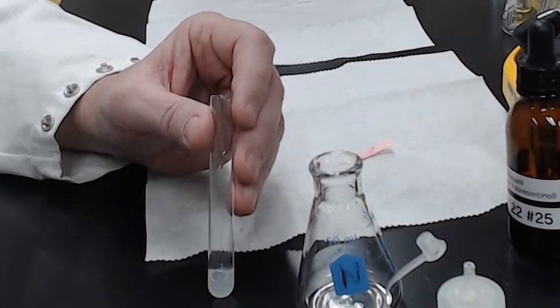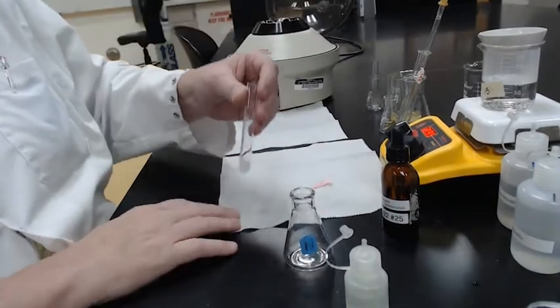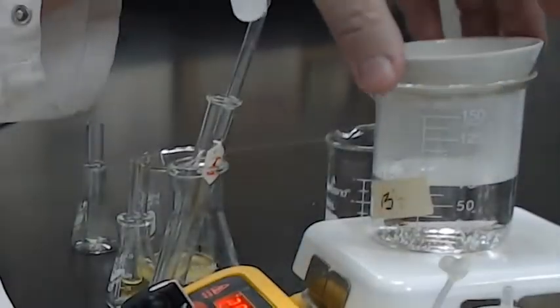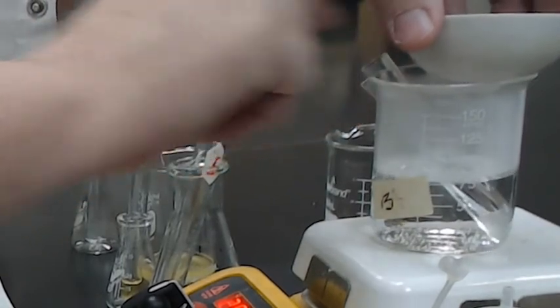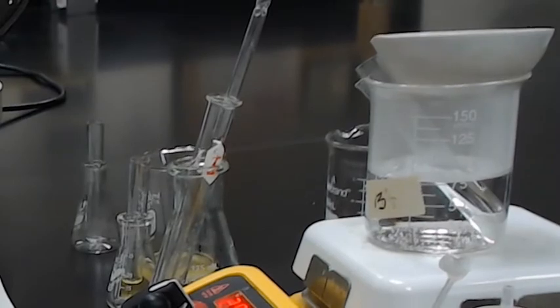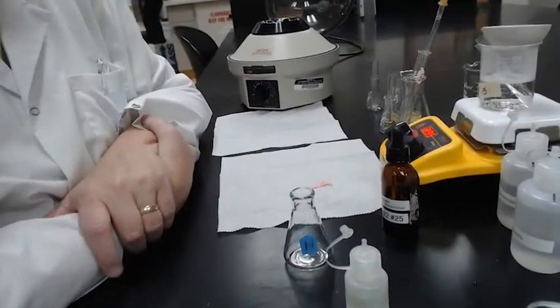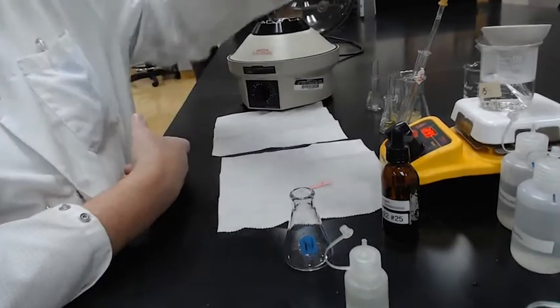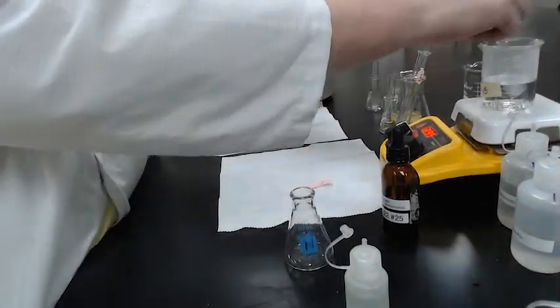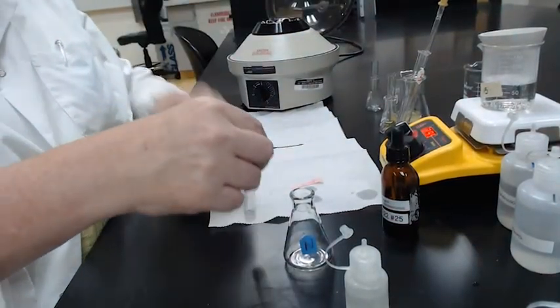And so what we are to do now is centrifuge and decant. Actually, I'm going to let this finish precipitating. I'm going to borrow my hot water bath for a moment from my evaporating dish. Just balancing that carefully. Let it heat up completely. Alright, that's enough heating time in my opinion. All right, definitely have cloudiness. Let's go for centrifuging.